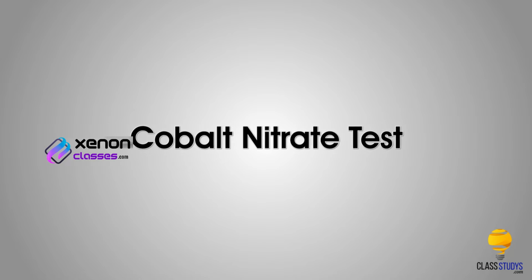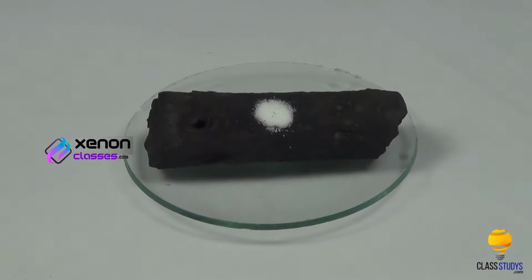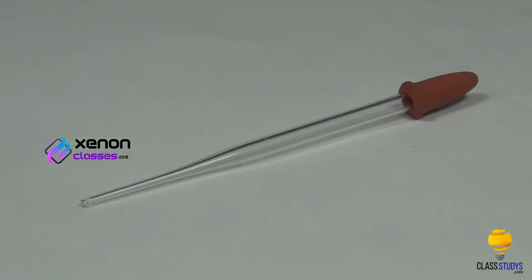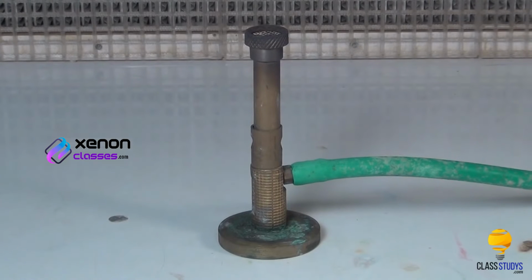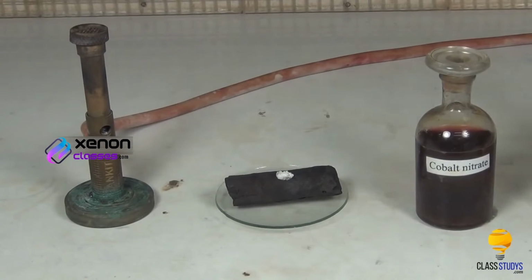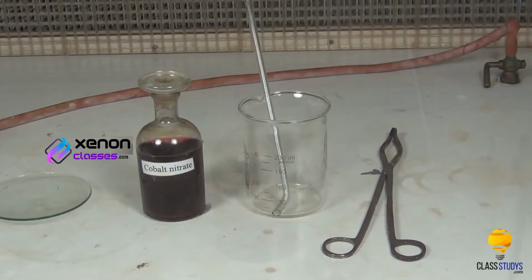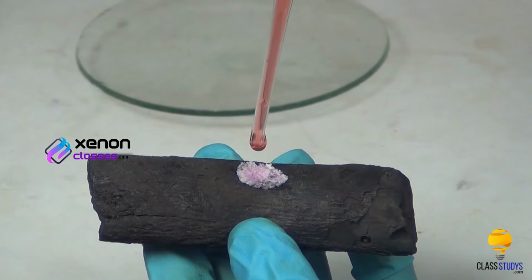Cobalt nitrate test. Materials required: white residue obtained in the charcoal cavity test, cobalt nitrate solution, dropper, tongs, blowpipe and Bunsen burner. Procedure: take the charcoal piece with white residue in it. Using a dropper, add a few drops of cobalt nitrate solution to the white residue.